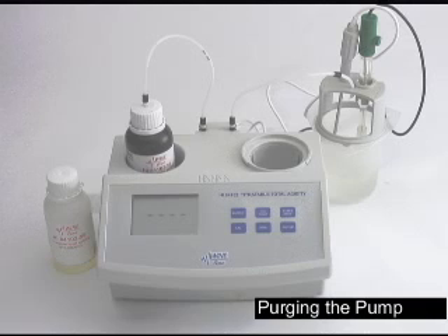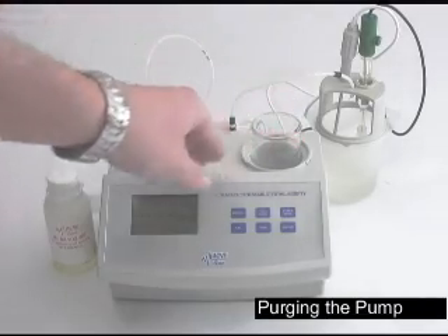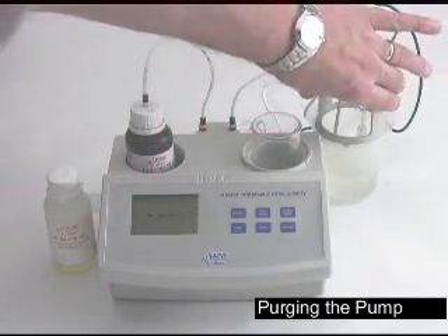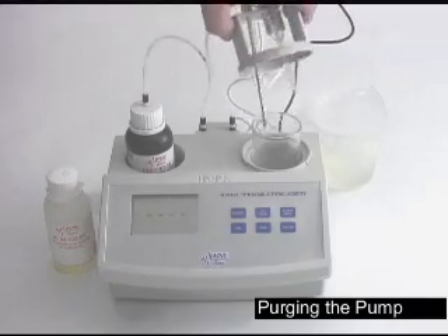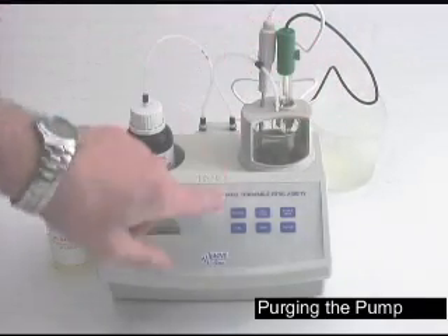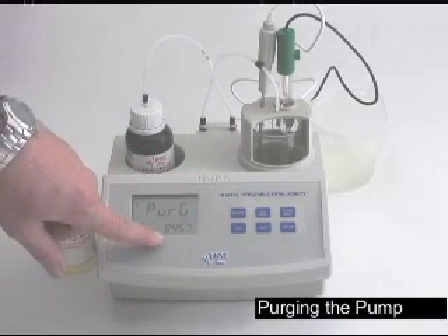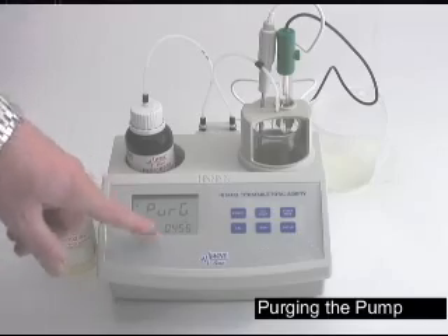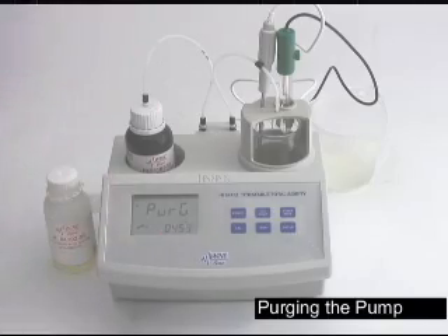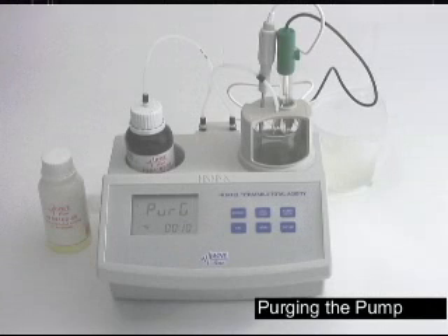Now that we've calibrated the pH probe, the next step we want to do is purge the peristaltic pump. Place a beaker in the right side of the titrator. Place the cap and tubing back on and press the purge cycle. The purge will count down for five minutes and then shut off automatically, which will give it ample time to remove any air that's in the line.